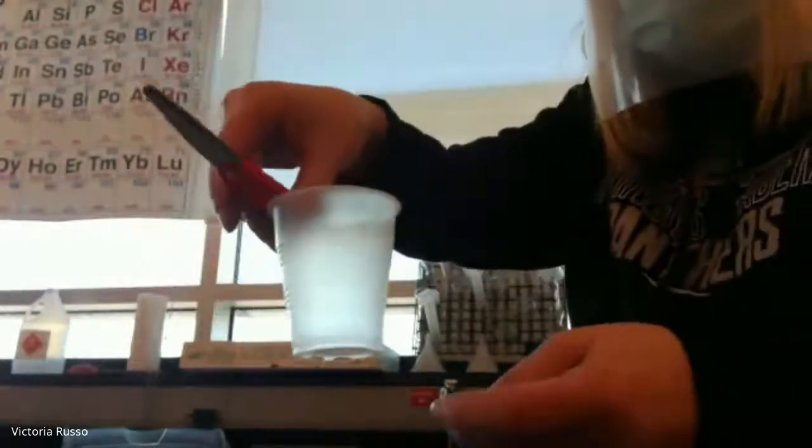So this is now step 2. By cutting it into smaller pieces, it gives it more surface area so it can react more quickly. And we'll talk about that when we get to the kinetics unit. I'm just going to zero the scale again, and I'm going to cut small pieces of the metal. I'm cutting pieces of the metal into this cup. It's hard to hold up and do it at the same time. But again, I'm cutting the pieces of the metal into the plastic cup.